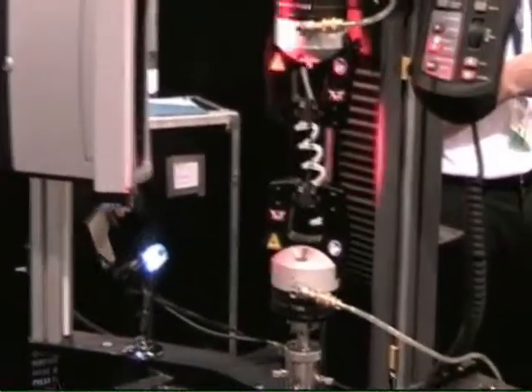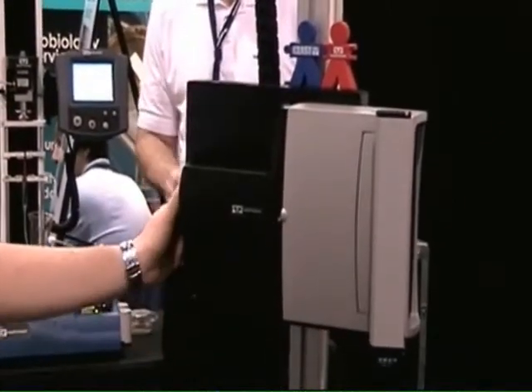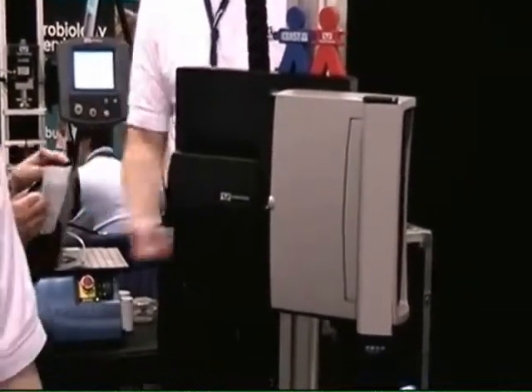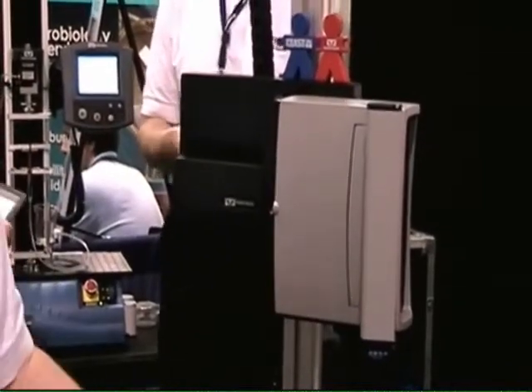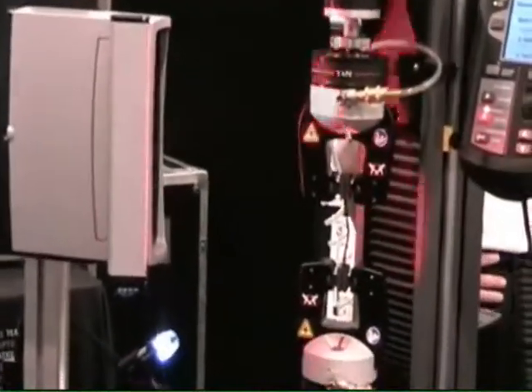We're also showing off the video extensometer that we've had for a number of years. It's worked really well for us. It works on many different kinds of materials — in this case, typically biomedical tubing. Right now there's a rubber specimen in there. It works on metals, plastics. We have a lot of customers using it for pretty much everything.